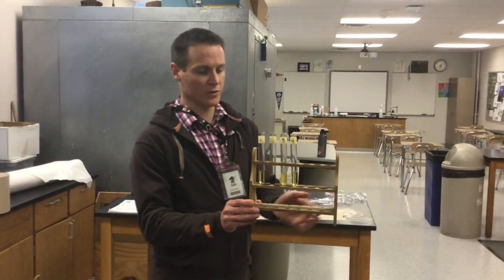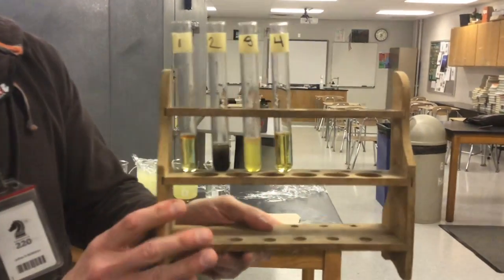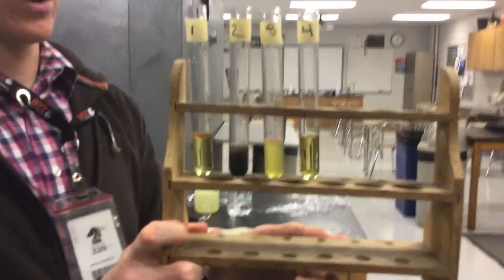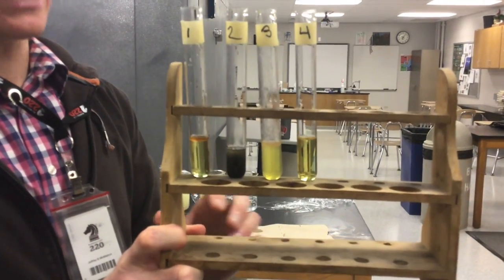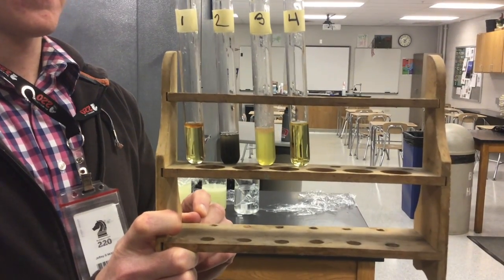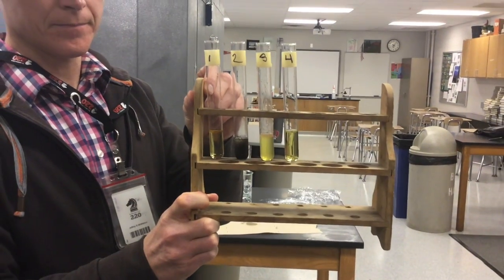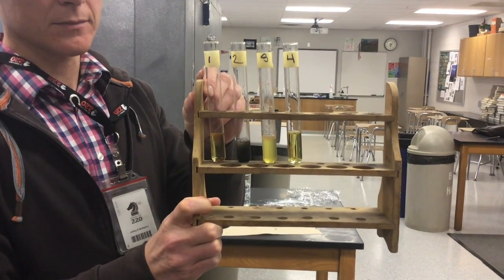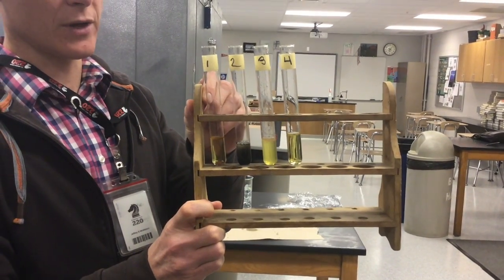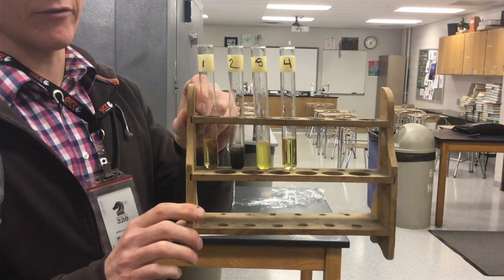Okay, guys, the result is in for our iodine test, and remember, iodine is testing for starches, long-chain carbohydrates, and we can see that there is a positive and that there are 3 negatives. So you should record your data in your data table based on what you see here. Put a plus for a positive test and a minus sign for a negative test. Good point. I'll reiterate what Mr. Kedzie said. Again, a plus for a positive and a minus for a negative.